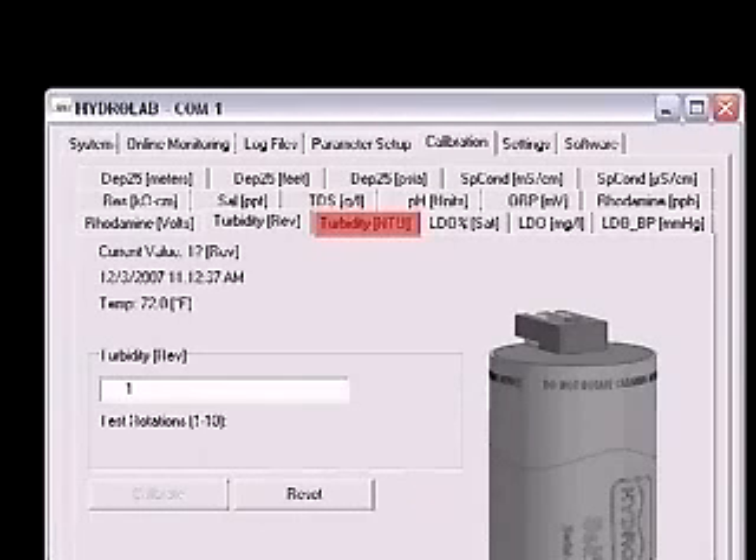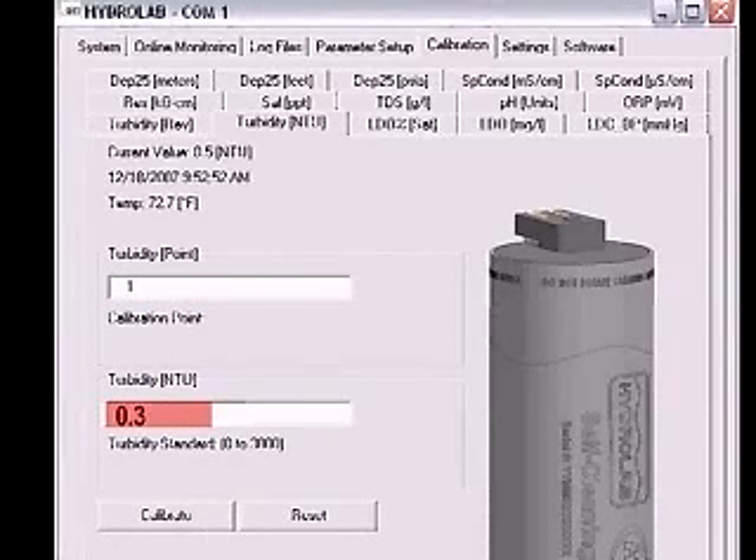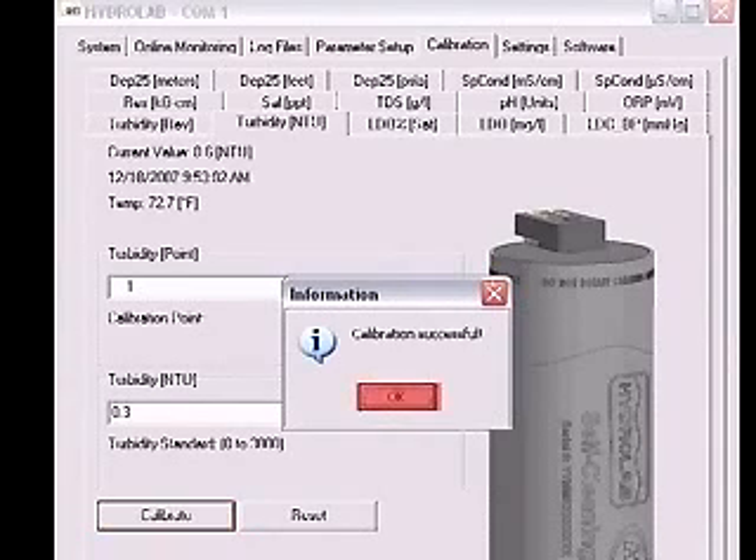Now click on the Turbidity NTU tab. There are two boxes on this page. In the box labeled Turbidity Point, enter a 1. In the box labeled Turbidity NTU, enter a value of 0.3 to 0.6, depending on the cleanliness of the sensors. When the readings at the top of the page are stable, click Calibrate. Click the OK button in the Calibration Successful window.